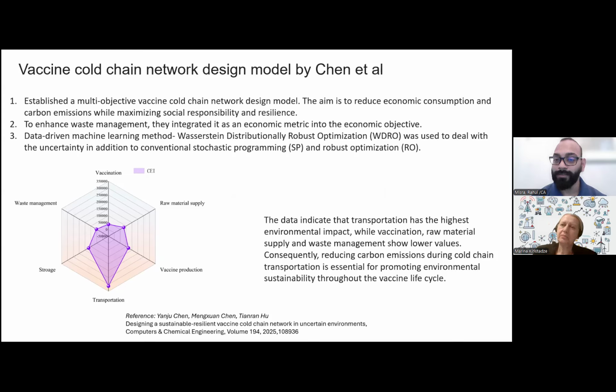Even TRPS, because, as we mentioned initially, in the development phase we first need the minimum testing required and the minimum volume of testing required. TRPS uses such a small volume of sample, and it gives you a lot of information about particle sizing.